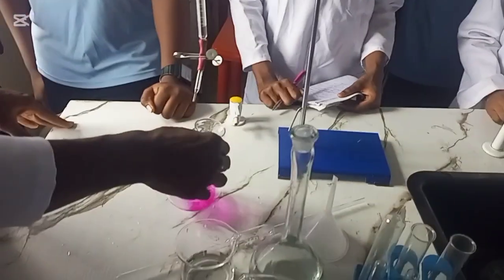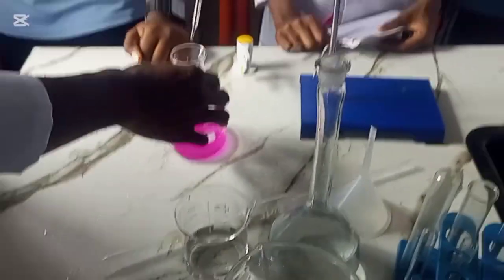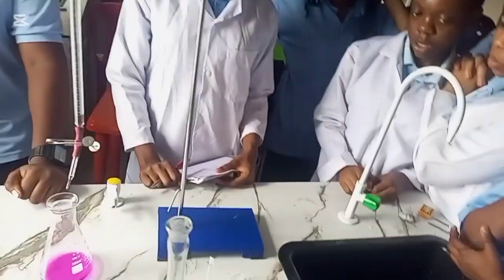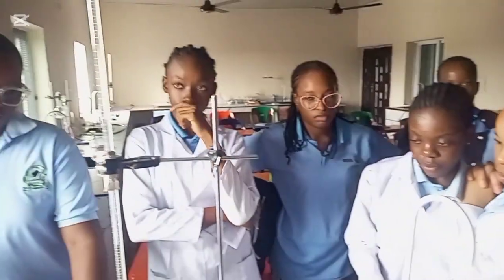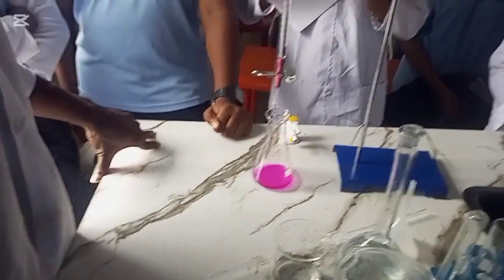We are going to be very careful with the titration, because any little drop can bring about a color change. But the beautiful thing about phenolphthalein indicator is that the color changes to colorless. It will appear like any of these reagents we have here. That is the end point of the titration. The end point of a neutralization reaction is the point where all the acid has been neutralized by the base.